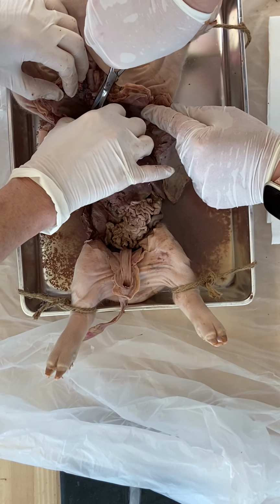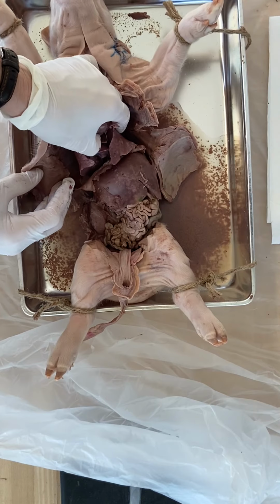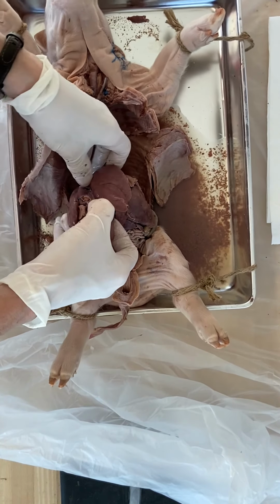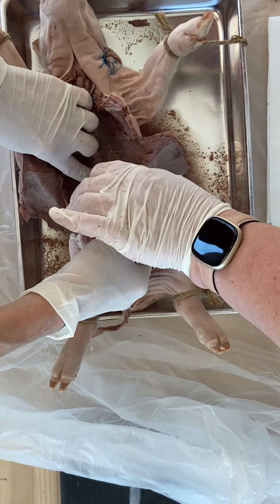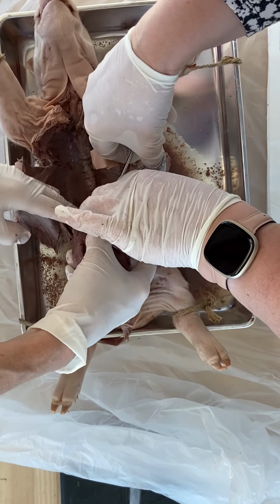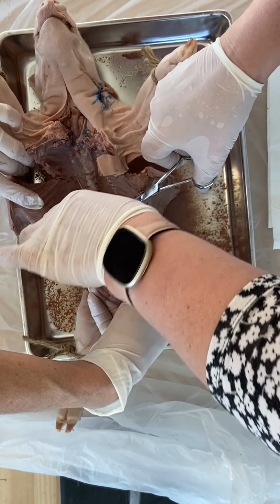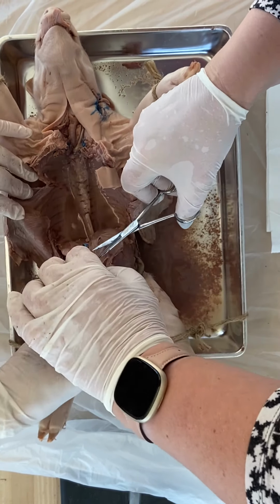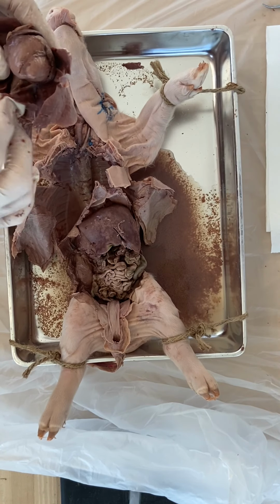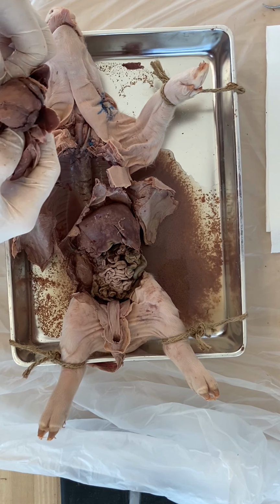This is what they call a pluck. If you take this and you get the heart and lungs, when you get it from a slaughterhouse, they'll call that a pluck. We should be able to just pull that little pluck right out. Maybe we've just got membrane or something. Something just gave way then. There we go. That's a pluck. If we're doing a heart-lung transplant, just look how much they take out.